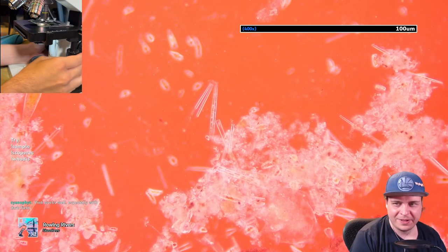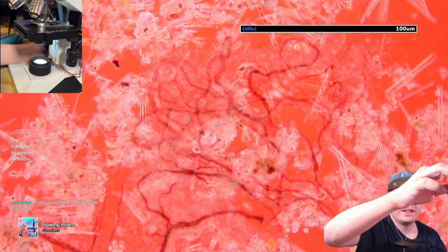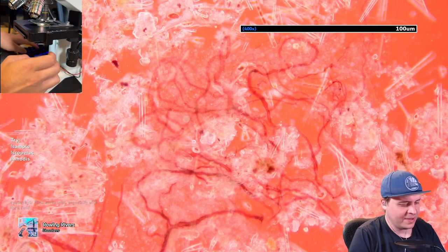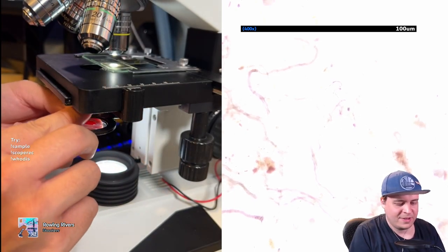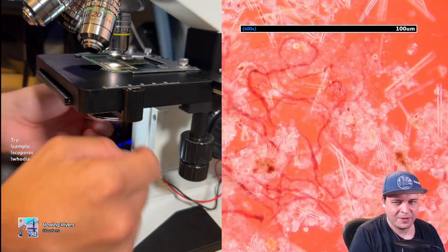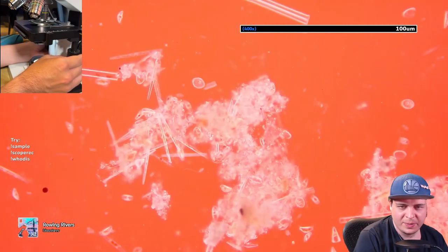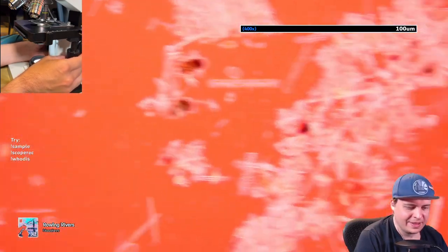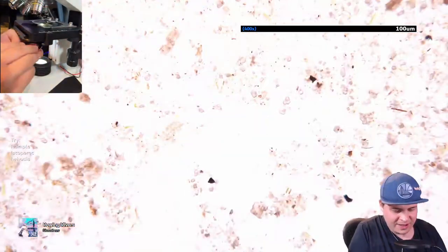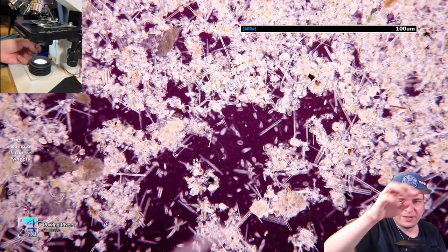Here I'm using a red filter. You can buy Rheinberg filters on eBay — just figure out which diameter you need for your filter holder. You can also make them yourself with photo gels from Amazon, which are really cheap, and that's what I usually do. Now I've got red in there and I can put a blue on top of that — and now we've got purple.